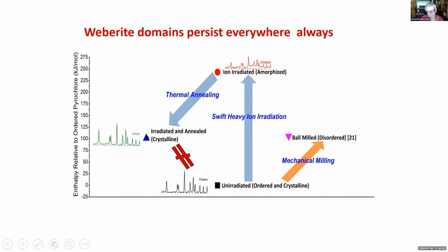very long time. And in fact, for the sample to go back to the initial pyrochlore state, we don't know how long that would take. We have not done experiments that would be a month longer, a year longer, something like that.